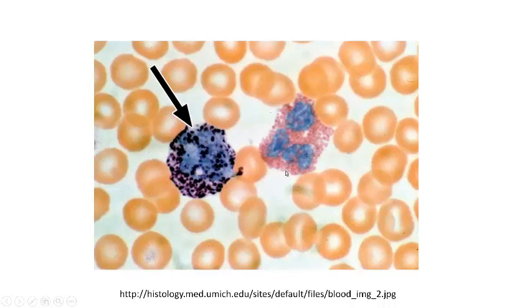Here's an eosinophil, and the eosinophil has a bilobed nucleus, so here's one part of the nucleus and here's another one. This has a really funky shape in this slide, but that's okay. You should recognize it for the color. The granules inside the eosinophil, this is a granulocyte, as is the basophil, as is the neutrophil on the previous slide. This eosinophil, all of the granules in it take up eosin dyes, the red dyes.